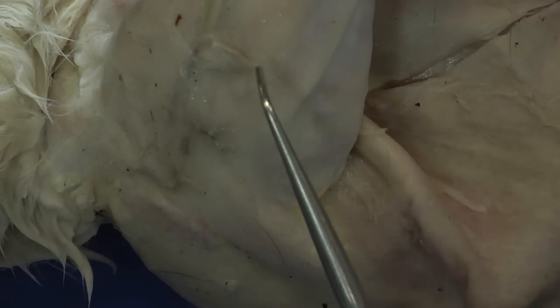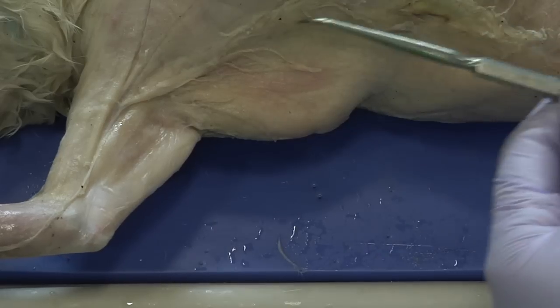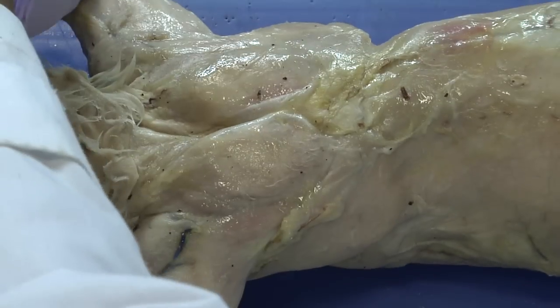For the biceps, we are going to need to remove this top muscle. So in order to do that, we are going to create some incisions. To get a better angle, I'm going to rotate the cat over to the dorsal side.